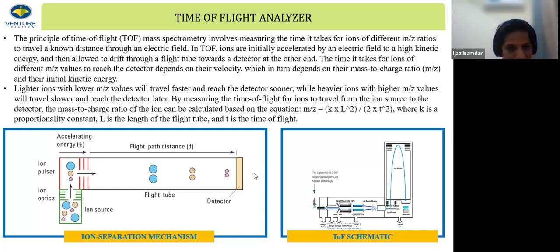So let's say if this is 100 meters, I make it 200 meters. So what happens? The distance between these three athletes will increase. Quite intuitive, right? So this is exactly what the vendors do when they talk about a reflector. This is actually the schematic of the equipment that we have in the lab. What we are doing is attaching something called a reflector. So the reflector is attached, and the ions get reflected from it, and the detector is placed here.